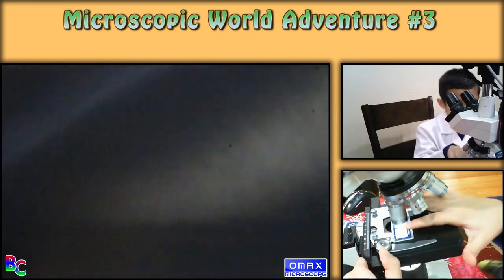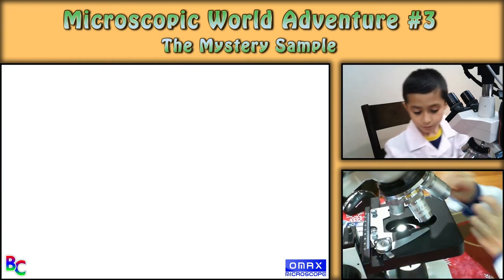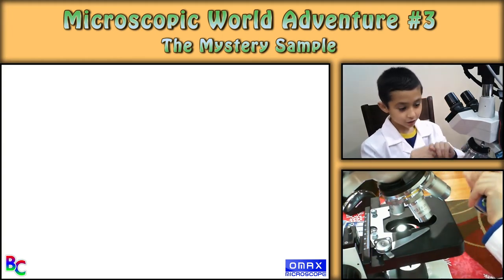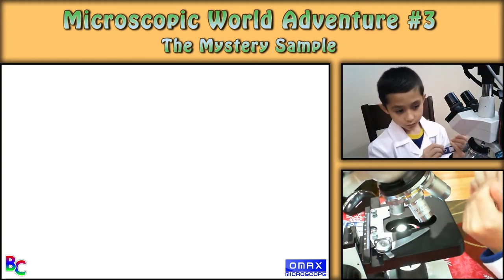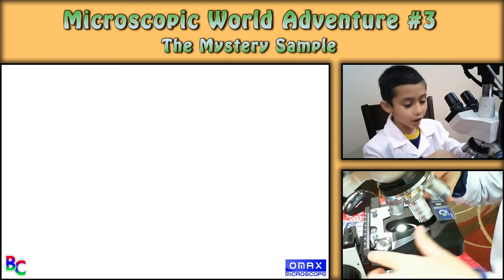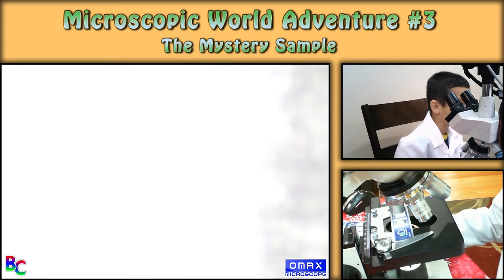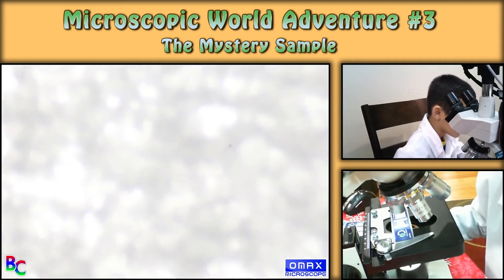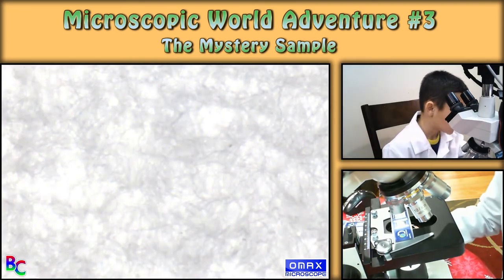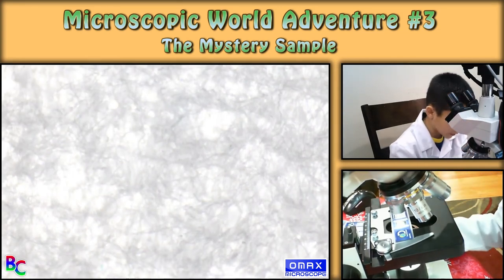So now it's the mystery sample. I will not be telling you what it is — I'm just gonna put it on this side so you can't see what it says. This is gonna be such a hard one to guess. There's like white — like hair, I'm guessing.